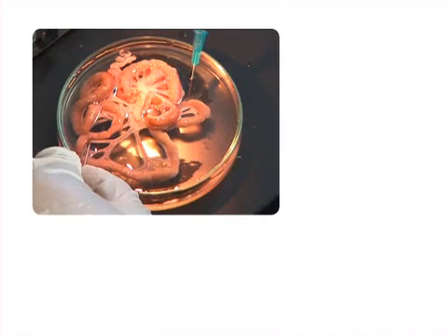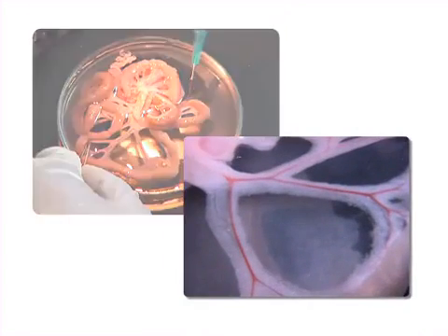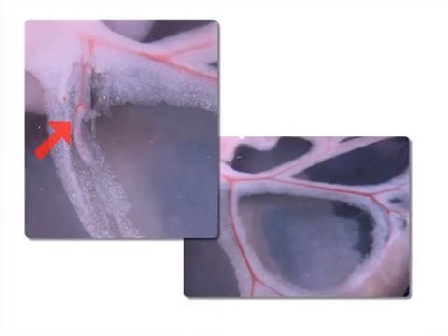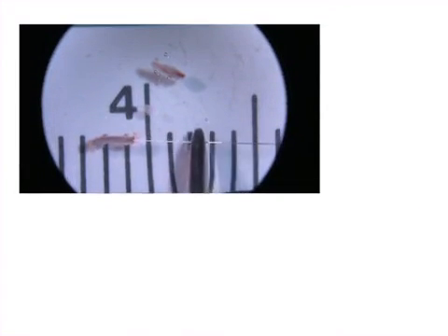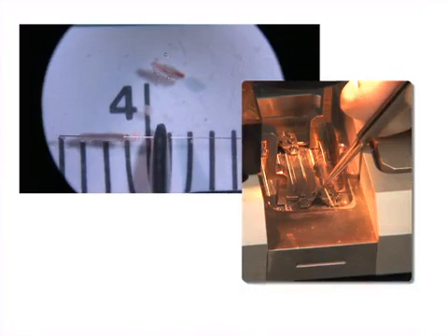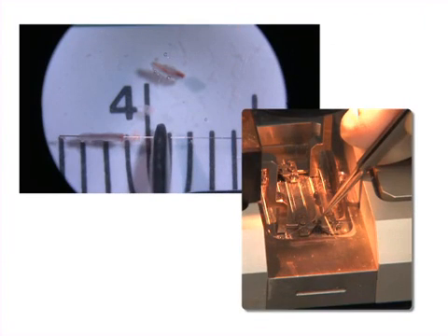This is accomplished by first isolating the mesenteric arcade from animals and dissecting out the resistance artery branches. Next, the first of two stainless steel wires is threaded through a short segment of the dissected artery, and the vessel is mounted into the myograph chamber.